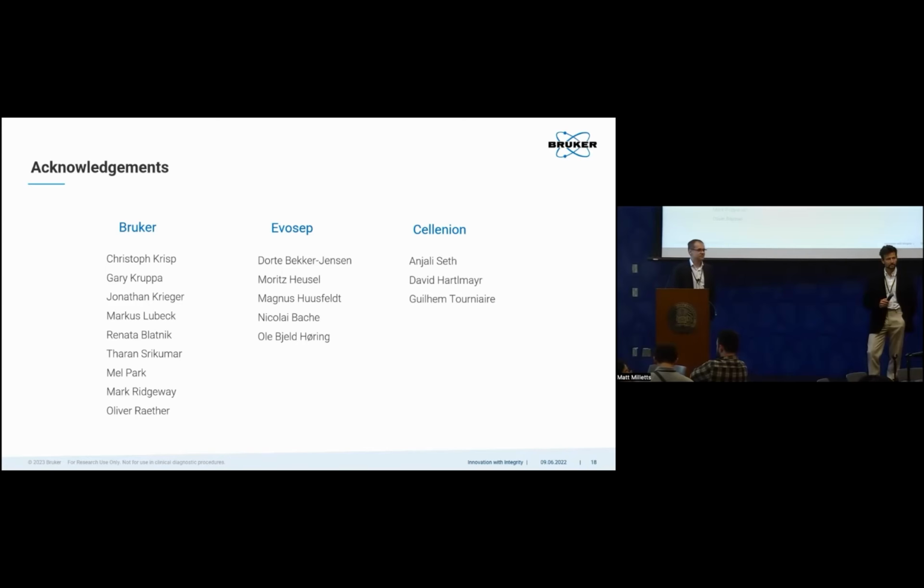Then, in a way, what I'm asking is, let's say you take one peptide and you see if that is sensitively quantified over a linear range. What you're saying is, yes, you have this incredible dynamic range where you can pick up the very low abundant peptides in addition to the very high abundant peptides, but I think it's a slightly different question. Then I'm not sure what your question is, sorry. We'll talk later, thank you.